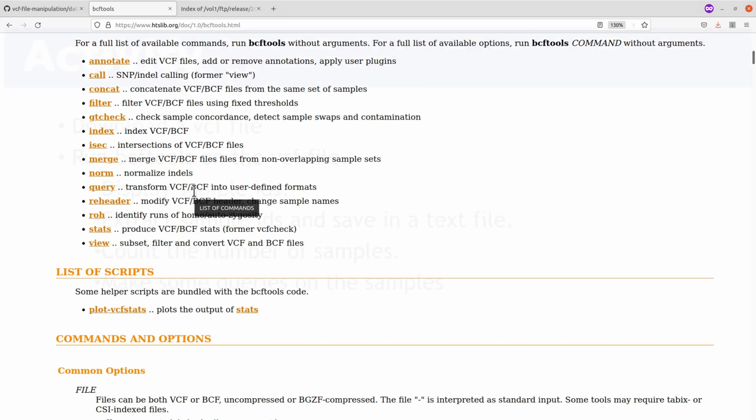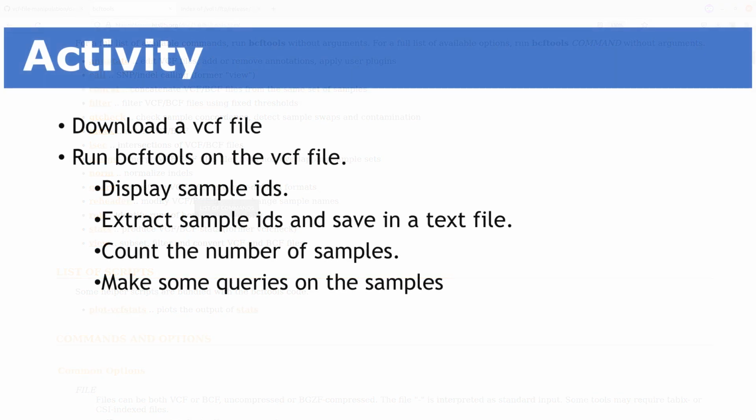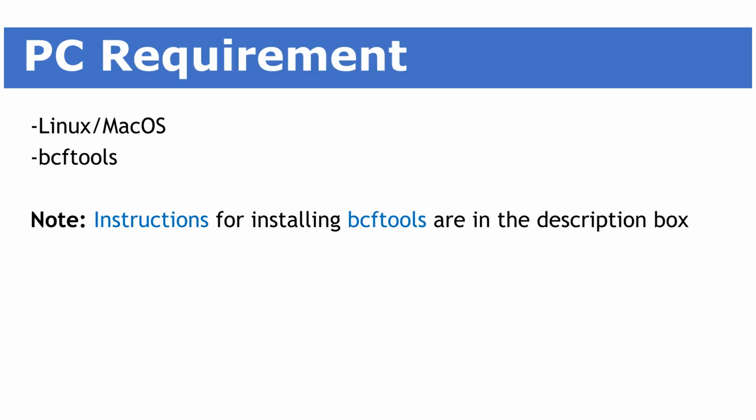And so for this exercise, we are going to first download an example dataset, and then we are going to extract the sample IDs from that dataset using bcftools. And so this leads me to the next thing, which is the PC requirements.